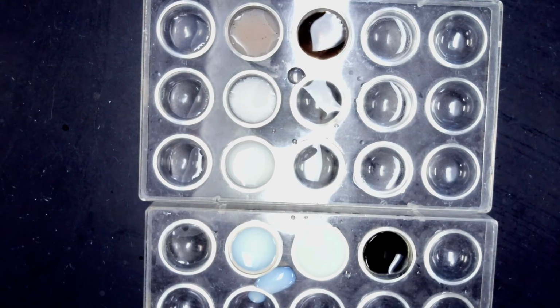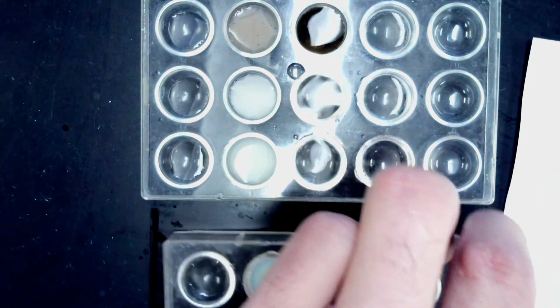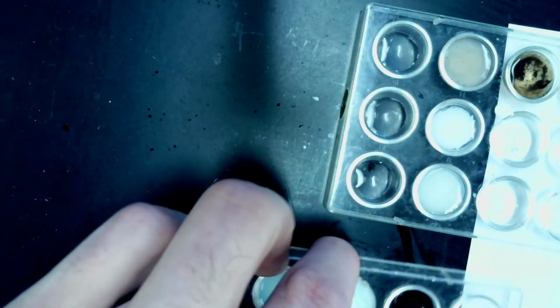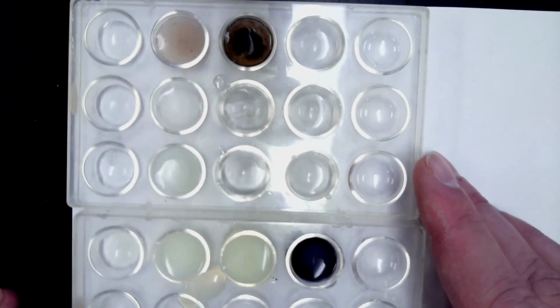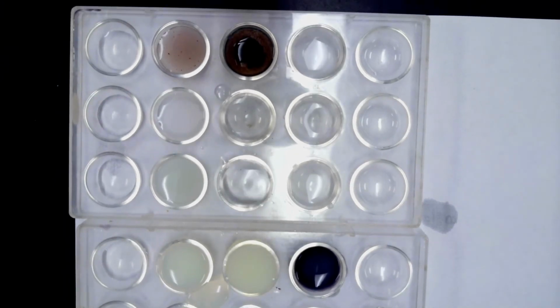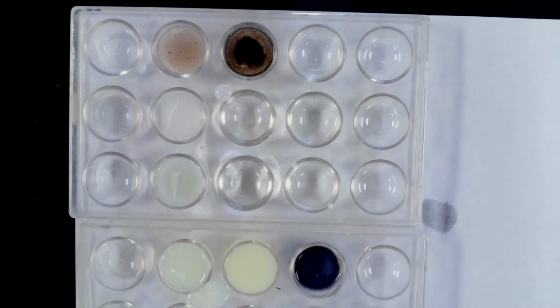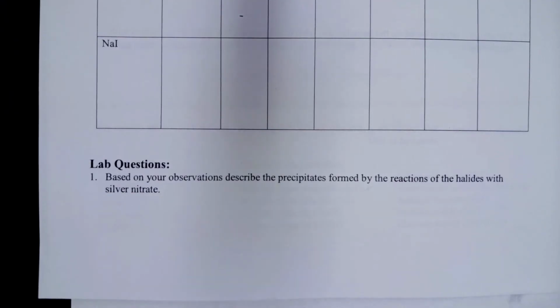And the last one, you can see it turns black. I believe I put a white paper under that last one so you can see it, but it did turn a dark black color. Yeah, so there you can see it a little better, and then you can kind of check out the other ones too. You can see in the third row, the ones that dissolve, so you may want to pause the video and just double check your observations. And again, make sure you put that black precipitate for the bottom.